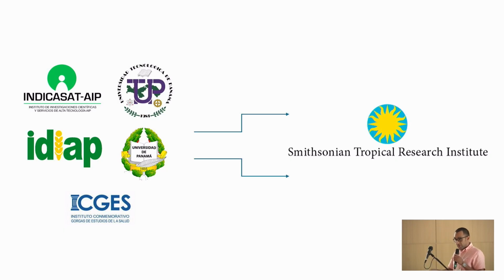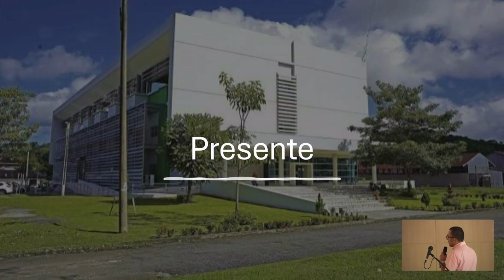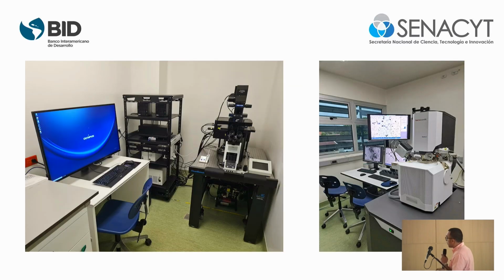And this actually happened this year when they basically closed the bioimaging capacities, and also they had the shutdown, so we cannot access those resources. But we knew that from the past, so we applied for money from the Banco Interamericano de Desarrollo and acquired 2 new high-end pieces of equipment for bioimaging, this ESEM and this confocal microscope. And so we created our new bioimaging system in DICASAT. So we have these 2 equipment.